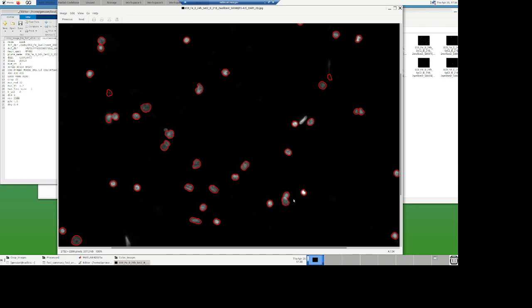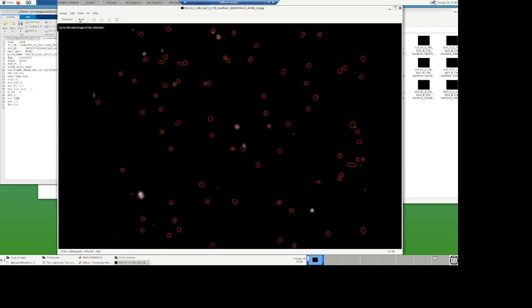So those are things that I don't break down. It's too complex for me to do the segmentation for that. We need some clever system. My system is pretty good. It does wavelet and things like this, but okay. That's field of view 1, then it repeats for field of view 2. You can see that cell's got tons of spots, some spots, and so on and so forth. So that gives you an overall view.